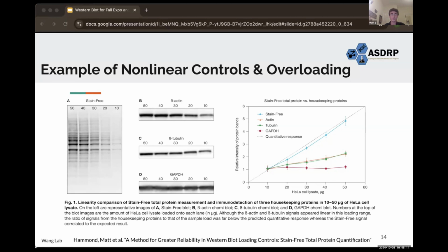And this ties with another issue of protein oversaturation, which occurs when the amount of protein has reached a point where it goes over the membrane capacity, and not all proteins are able to be detected, since the binding antibodies can only bind to the proteins on the top layer of the protein stack. Since not all proteins can be detected, this results in underestimation during the quantification process.